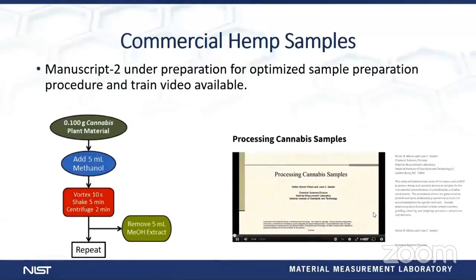The second manuscript that's under preparation is focusing on an overall optimized procedure for the sample preparation. In this case, we have published and released a tutorial video on our website for processing cannabis samples that goes from the grinding and homogenization process all the way through to the end, ready for analysis by the instrumentation.